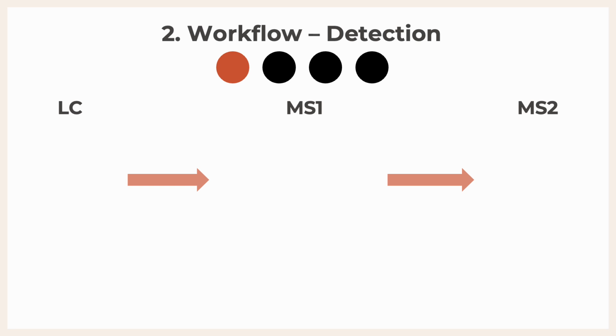So I'll just leave these as analyte and sample, but I'm not going to say if it was a protein or a peptide, because that allows for a little more ambiguity, and if you were using the bottom-up or the top-down method, right? So we have our sample.